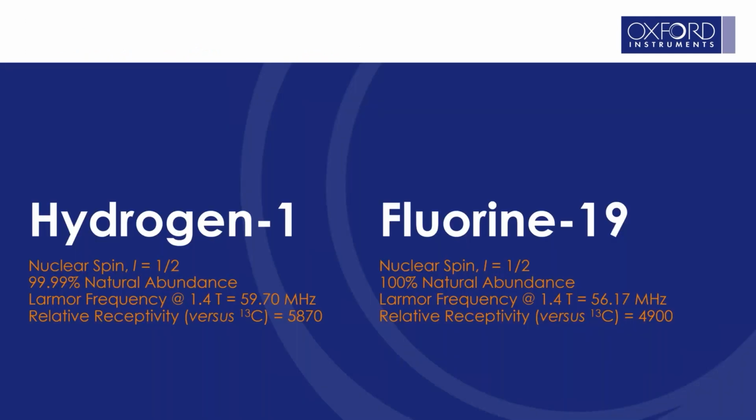While the title promised that NMR spectroscopy is more than just protons, we will start by looking at proton NMR spectroscopy, in order to identify the various features of an NMR spectrum, which are applicable to all one-dimensional NMR spectra, whatever the nucleus. All the NMR spectra we'll look at today, with a couple of exceptions, which I will mention at the time, were collected on a single standard configuration X-pulse broadband benchtop NMR spectrometer.